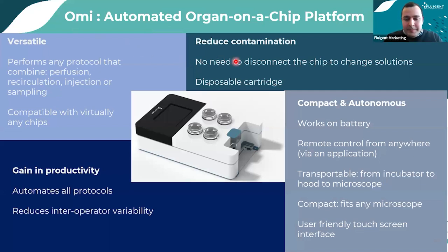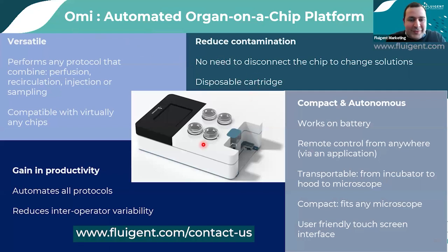Thank you, Luca and Arthur, for these two case studies, which illustrate the advantages of OMI. So just to summarize at the end of this webinar, as you can see, the organ-on-chip field is quite promising in terms of the advantages compared to the conventional methods that already exist in this field, such as 2D cell culture, and so on.